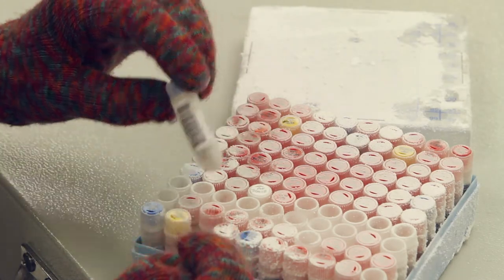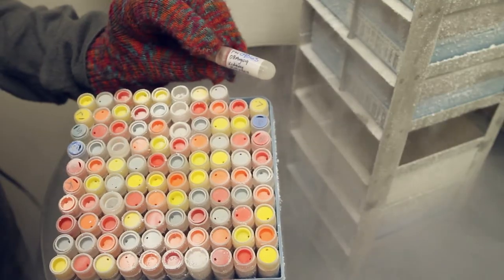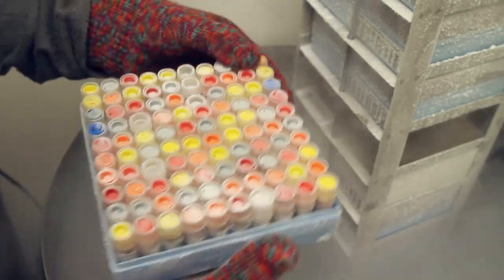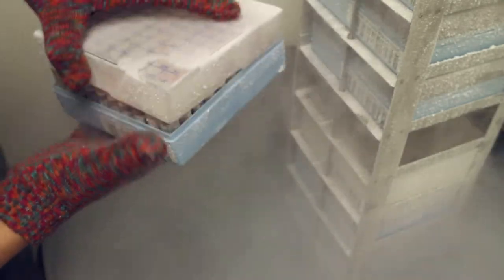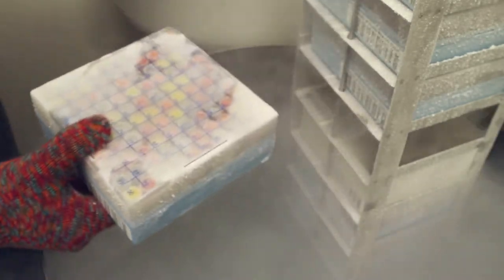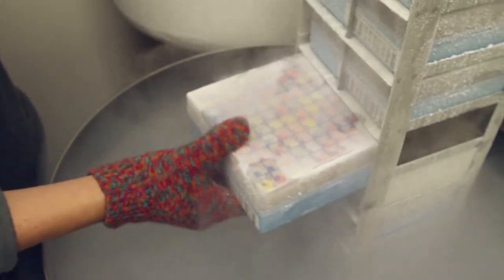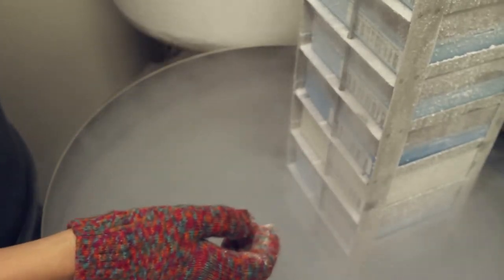The frozen tissue collection is actually built by the researchers in the museum, primarily. When they get a grant to go study specimens, they deposit their tissues in the collection. They use part of the tissue for their own research, and it is kept for others in the future to use them for additional research.